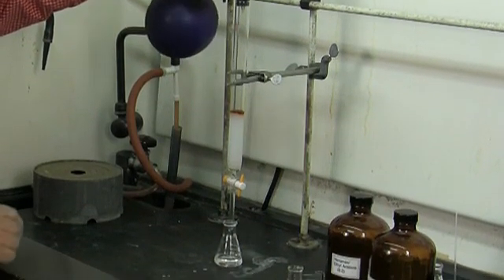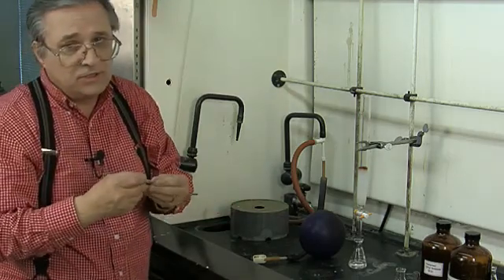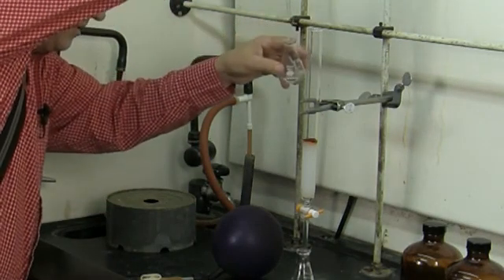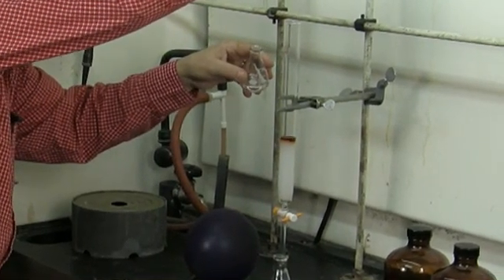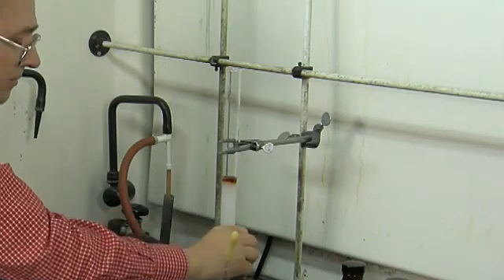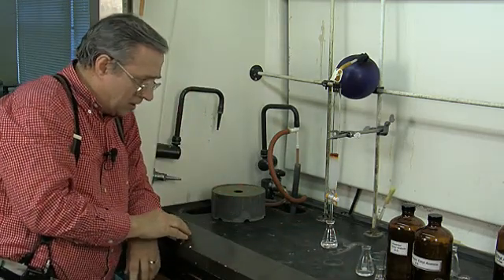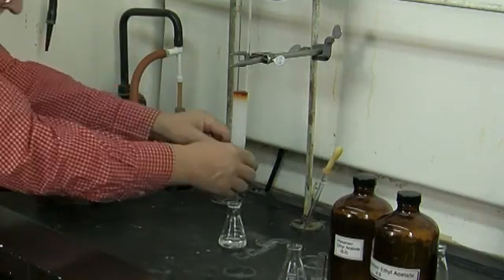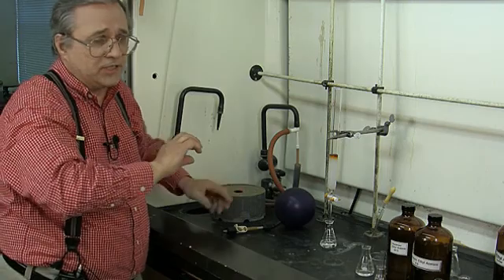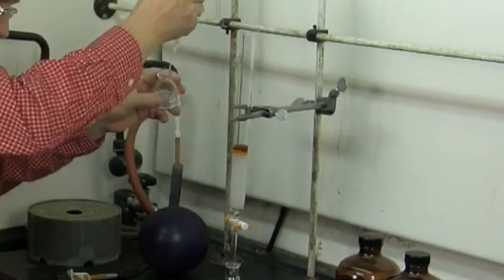Now we're going to use the hexane/ethyl acetate and very carefully add a little bit, then drain it. We'll repeat this maybe three or four times. The reason is that we want to get all of the ferrocene down into the silica gel below the initial level of the bed, because then we can pour in lots of hexane/ethyl acetate without disturbing that layer.